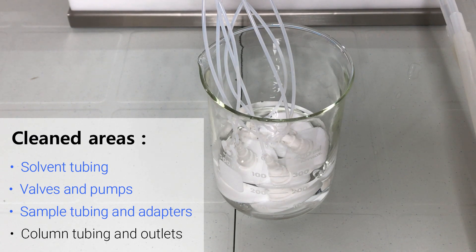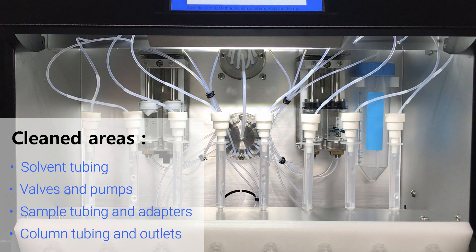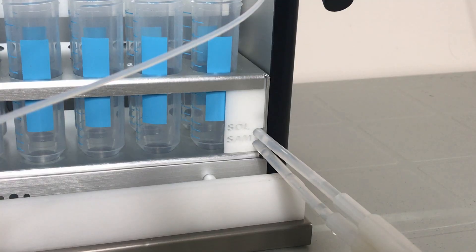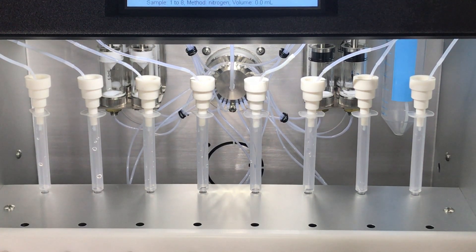The add sample step then draws the solvent back through the sample tubing, and then pushes it through the empty columns and into the solvent waste channel. A final air purge can be used to remove solvent remaining in the system. The SPE03 is now cleaned and ready for your samples.